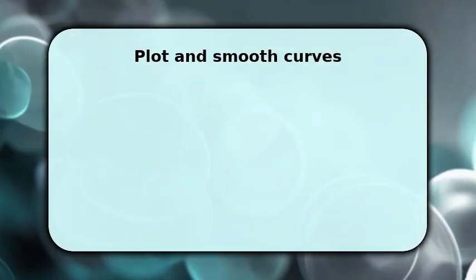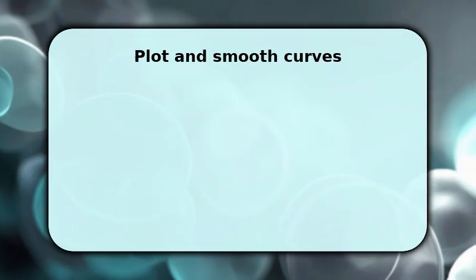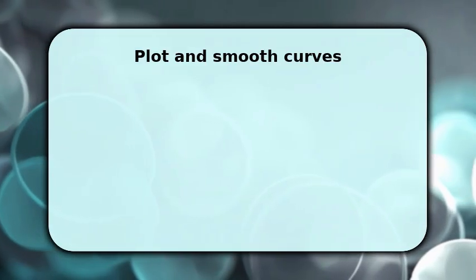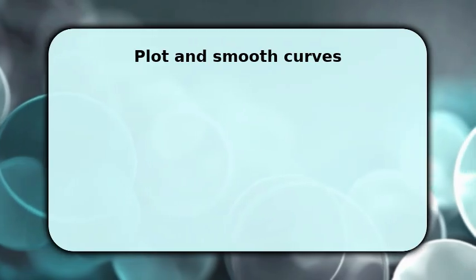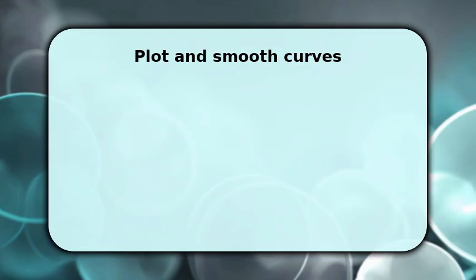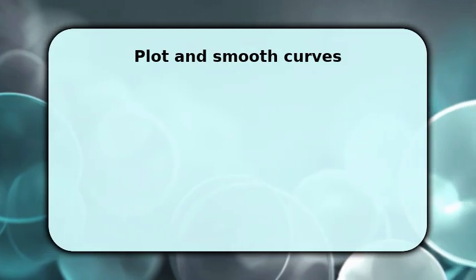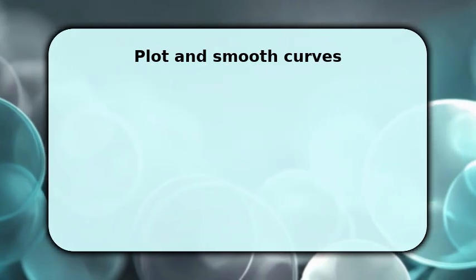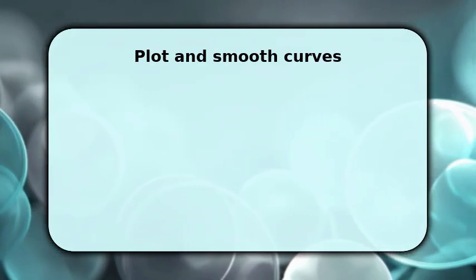Next, you plot the raw mass percent against temperature and visually inspect for noise or spikes. Apply a mild Savitzky-Golay smooth, second order with a 7 to 11 point window, to preserve peak shapes while lowering random noise. Once smoothed, compute the derivative DTG to reveal mass loss rates. Derivative peaks mark decomposition steps and precise peak temperatures.